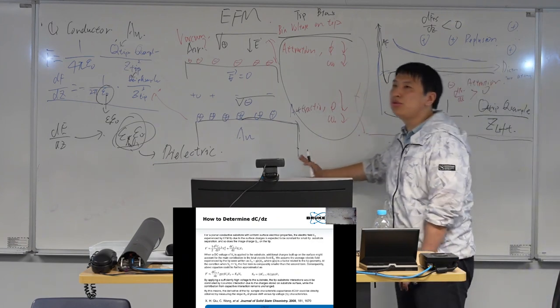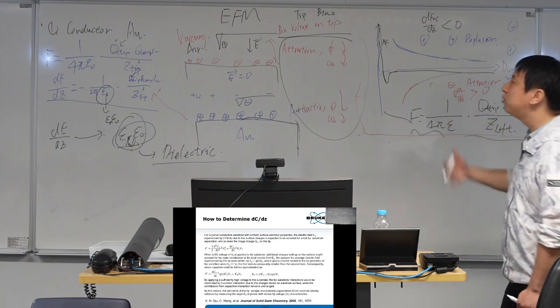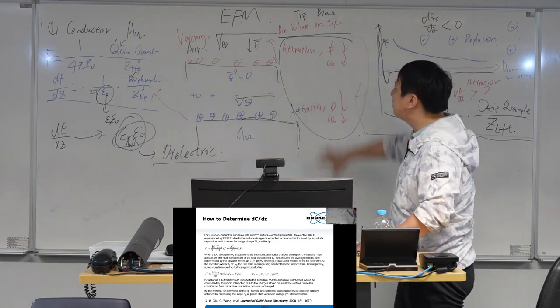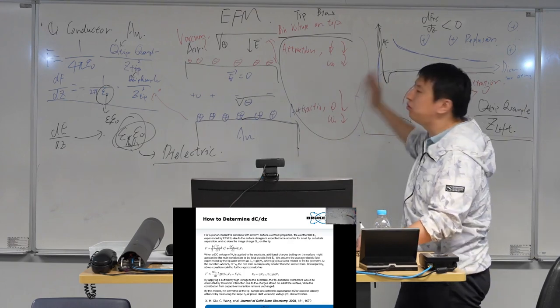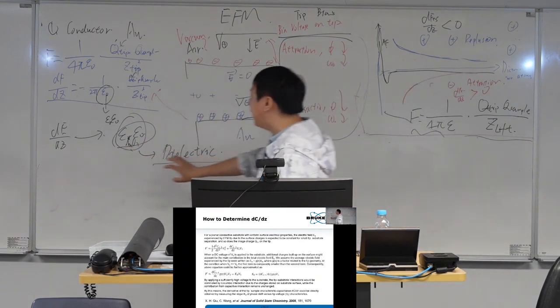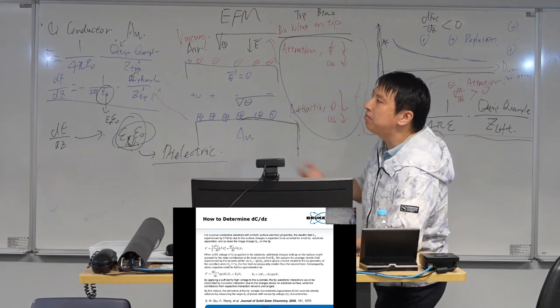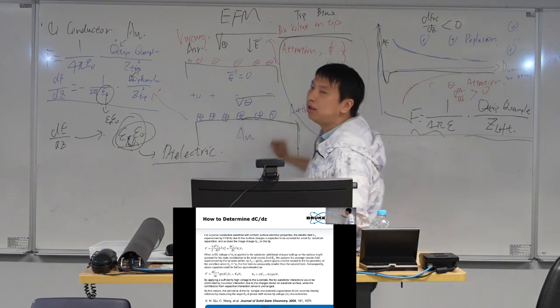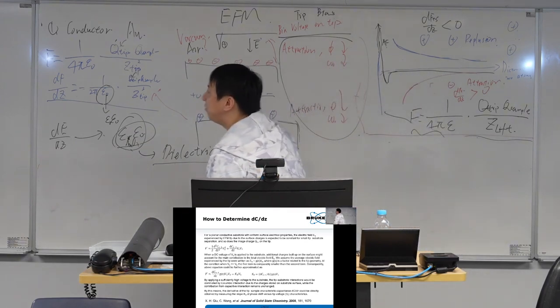Because this force is due to polarization of the conductor. It has nothing to do with the surface properties because it's a conductor. It's always a negative force. It's always attraction. We'll always get phase and omega 0 reduced. And from this force gradient, we actually get the dielectric properties of our medium, either air or the oxidized layer on the surface. Right? That's our conductor.